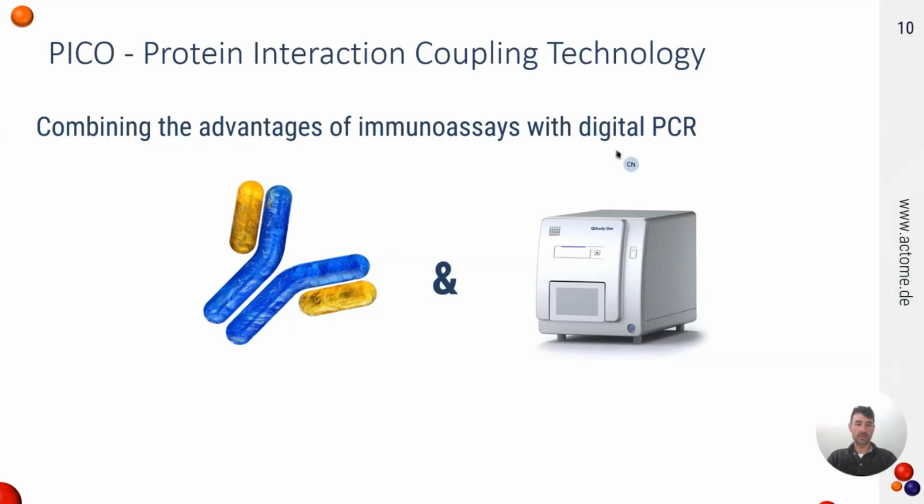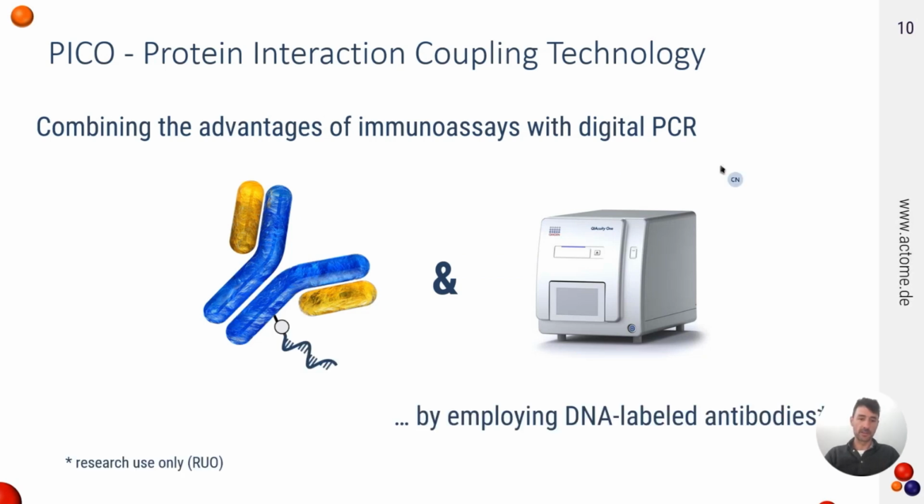So what is protein interaction coupling, short PICO? Actually, it is a quite novel, powerful technology which combines the advantages of an immunoassay with a digital PCR readout. So what do we do? We actually employ highly specific antibodies which bind to our target protein, and these antibodies are specifically labeled with DNA oligonucleotides.